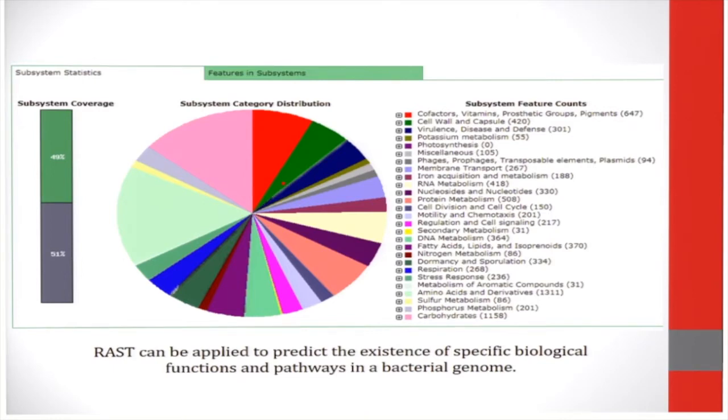This platform offers you the ability to look through your genome and identify specific pathways, such as the pathway associated with carbon fixation, antibiotic resistance, or other functions which are unique to your particular bacterium. By comparing this pathway with the phenotype, you are able to obtain an overview of your genome sequence data.